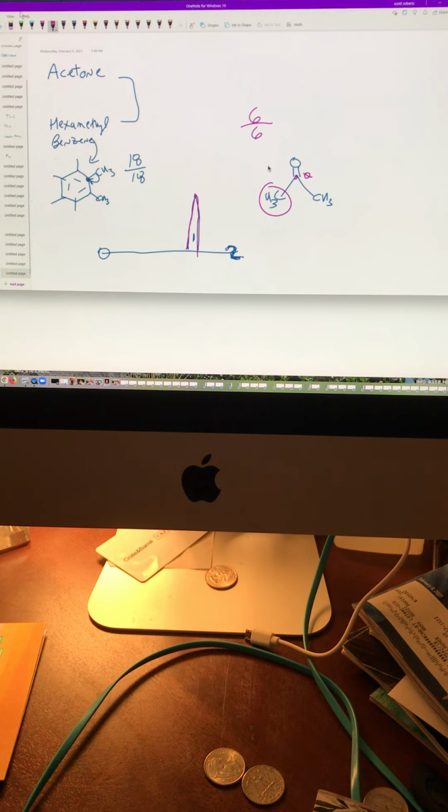The first thing I want you to realize is that you can't compare this height to this height. They haven't made NMR machines that do multiple things at once. It's only within a sample that the heights are comparable. You can't really tell, because the deshielding from the carbonyl is so minor that you wouldn't be able to distinguish them. So can you use NMR to distinguish these? Yes. Good. Okay, cool. Let's move on.